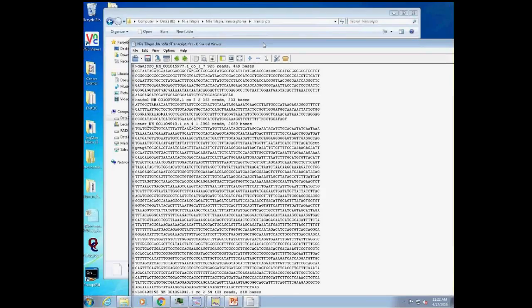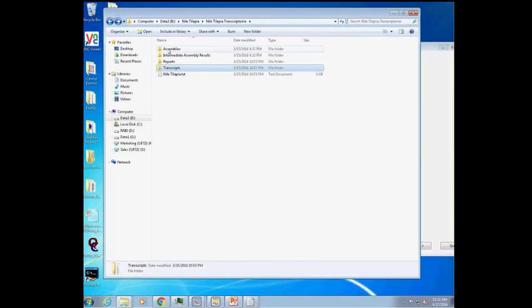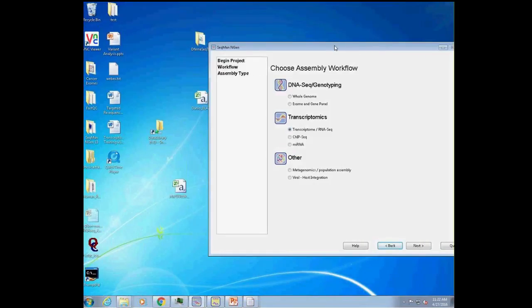these are my de novo assembled contigs, and this header of information was extracted from the database sequences. So we get the accession number, and you can see in this case there's a gene name. It is this information in the header that allows us to pull and link up the annotation information from the original annotation file. These are created automatically from the de novo assembly, and they're all bundled in this package, right? And the package is large and contains a huge amount of information.